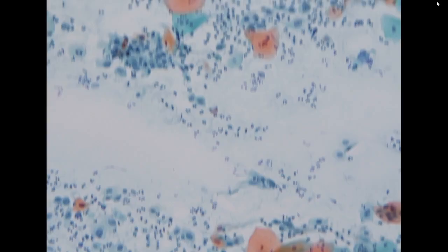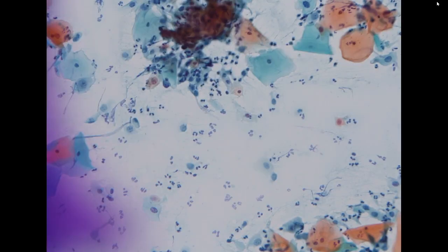And the patient will still get the appropriate follow-up management with this diagnosis. So we call this HSIL, and we would need to look for the past pap smear, but because this is the first pap smear the patient had in our hospital, it is okay. So this is an HSIL case, and we will see the follow-up biopsy. Okay, so this is for today.